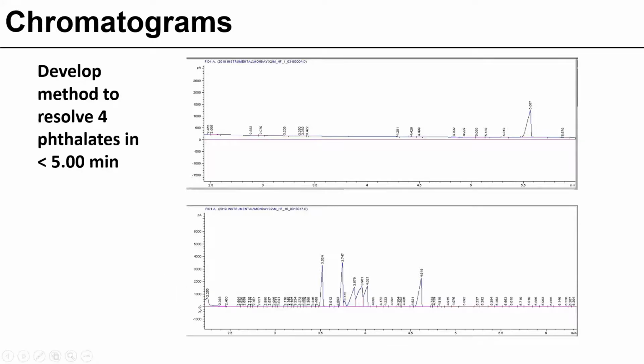So in the next run, maybe you bump that starting temperature up. And now you've got possibly 1, 2, 3, 4, 5, 6, 7 peaks. You're supposed to have 4. Where did those extra 3 peaks come from? Well, they might be the 3 peaks that didn't come off in the run before, and they're left over and carried over into this run.